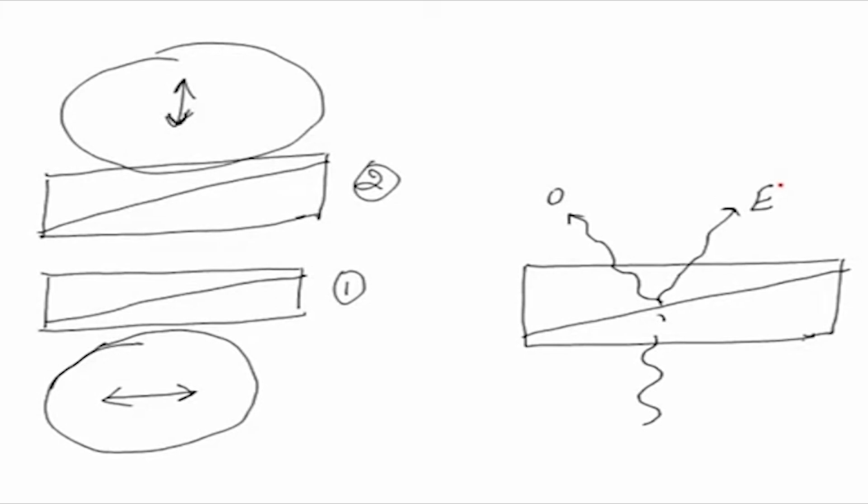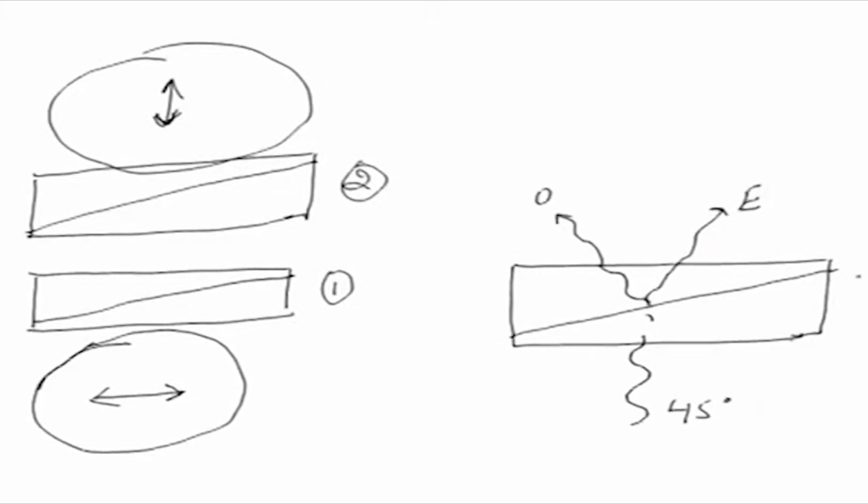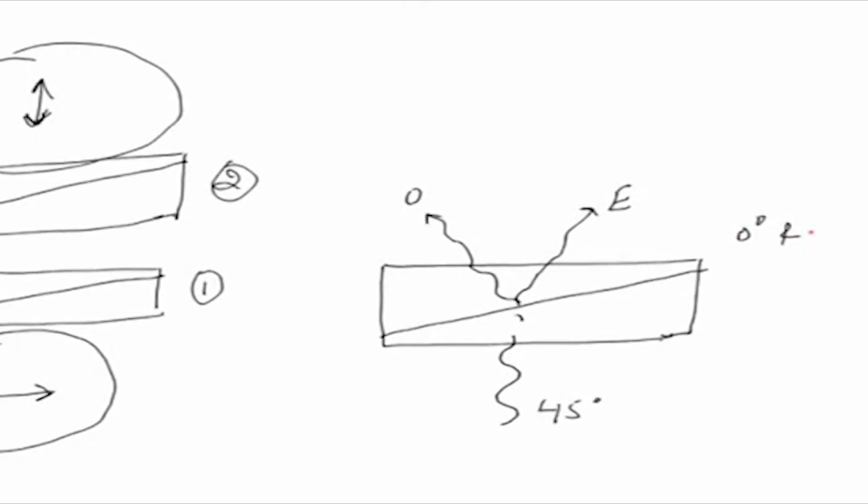Sheared means they are adjacently moving in the light path, or the optical path. Now, these two rays here which are sheared: if this ray's axis of rotation is oriented at 45 degrees, then these two rays are perpendicularly oriented, which could be 0 degrees and 90 degrees. So, they are perpendicularly oriented here.